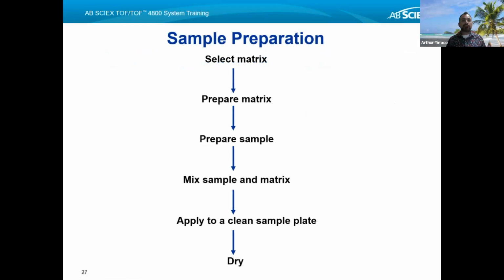All right, so here's just the workflow of prepping your actual sample. Depending on the sample, you need to select a matrix. Once you select your matrix, you have to prepare your matrix solution. Then you prepare your sample solution, okay? You prepare these two solutions separately, your matrix solution and your sample solution. Then you mix equal volumes of your sample solution and your matrix solution. You take that mixture, you plate it onto the sample plate, and you let that dry. Essentially you're drying it so that it crystallizes. So this is basically the workflow that you're going to follow in order to prepare your sample.